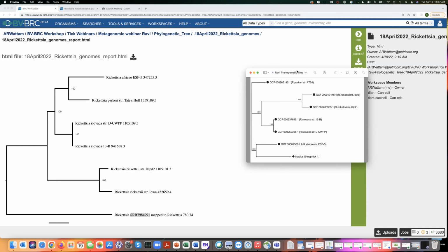So there are a couple of questions also from Claudia. I think she sent them as a direct message instead of to the general. So one was, how do I know which genomes I should select? I guess that's a more general question when you're selecting genomes. Okay.